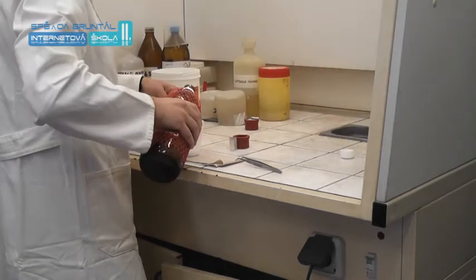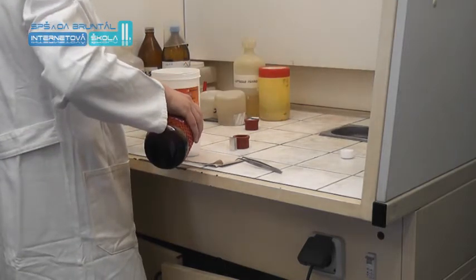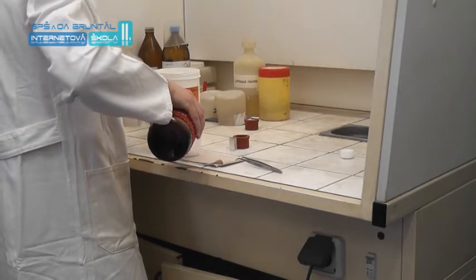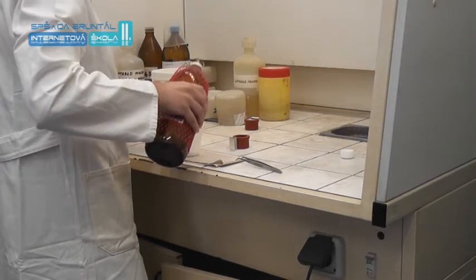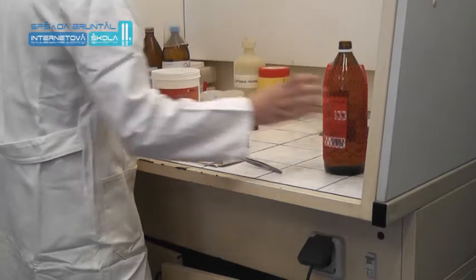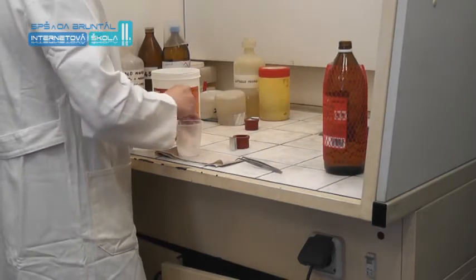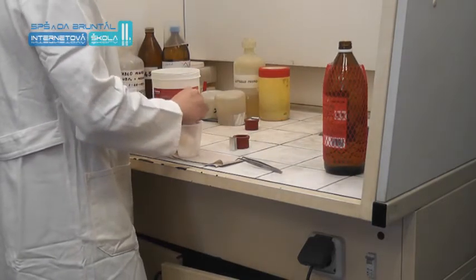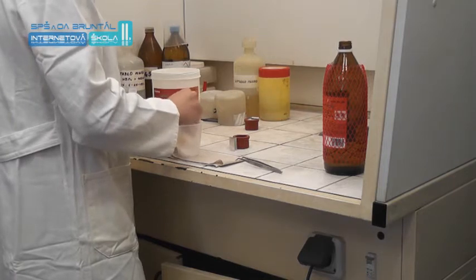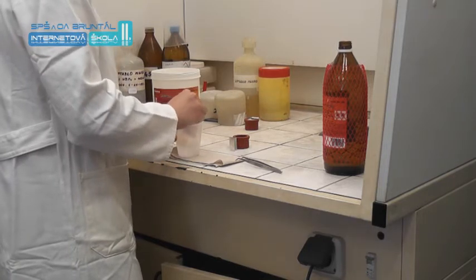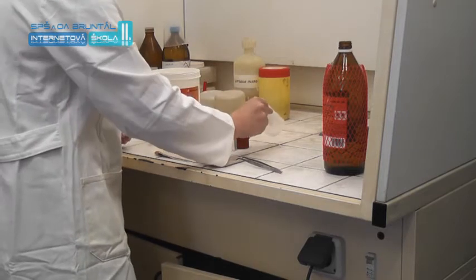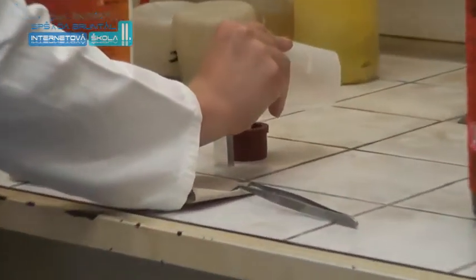This video is part of the application of microstructure analysis. Mikrostruktura examines phase components, types and proportions of microscopic constituents, shape, size and distribution of structures, and characteristics of crystal lattice defects.